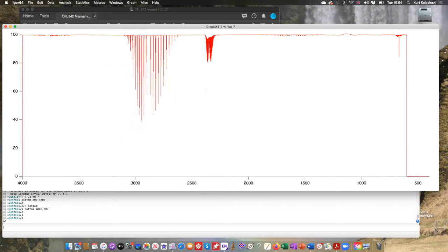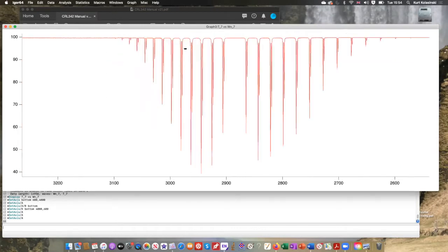Pattern recognition. Whenever you see a pattern in nature, nature is trying to tell you something. There is information in patterns. This is actually the HCl spectrum. And again, a branch here, something missing in the middle. It's almost like a mirror plane, right? And then there's another branch, lines going up and down. Oh, it doublets. Wonder where that's from.